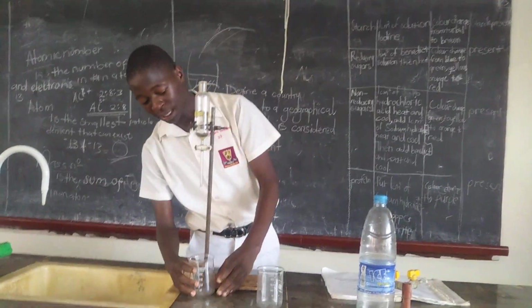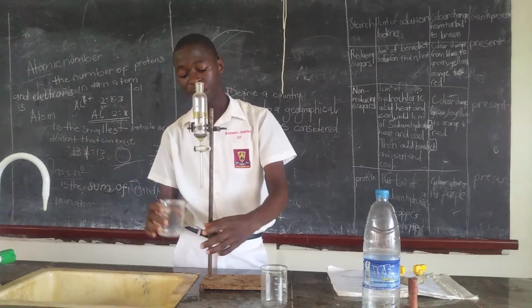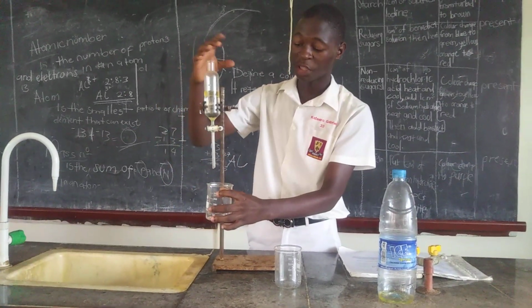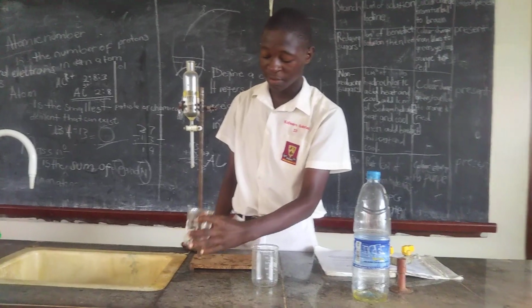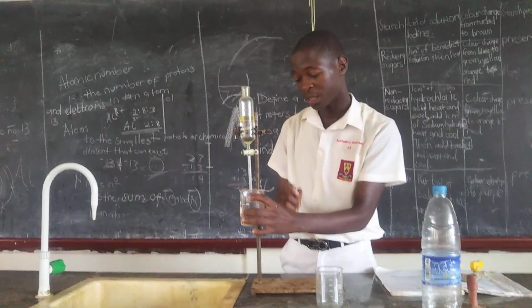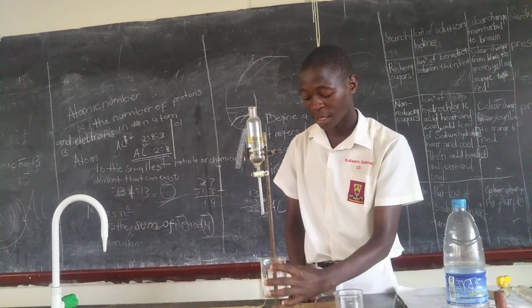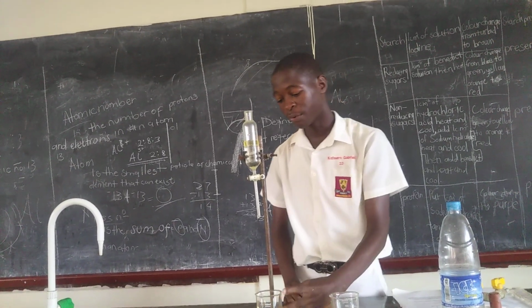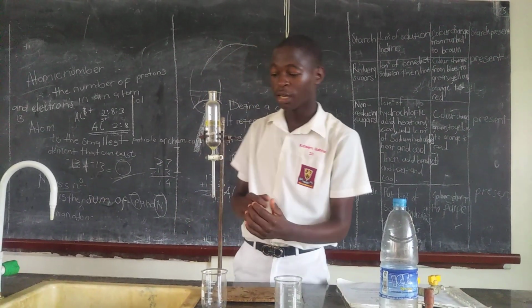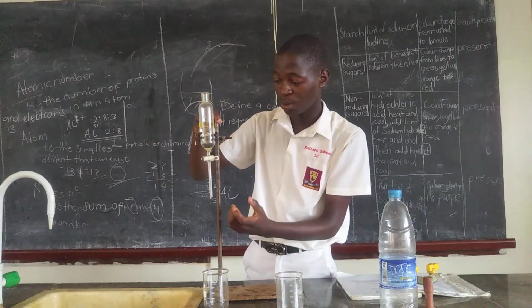So what I need to do, I make sure that I have one beaker in place that will help me to put directly below the spout of the separating funnel. So I make sure that it's in position such that our liquid is not poured out or misplaced. So as you see, I have to first measure, then it's in position for this water to get dropped into this beaker. So let's do it. I'm going to turn the turning point, and then this liquid will be out.